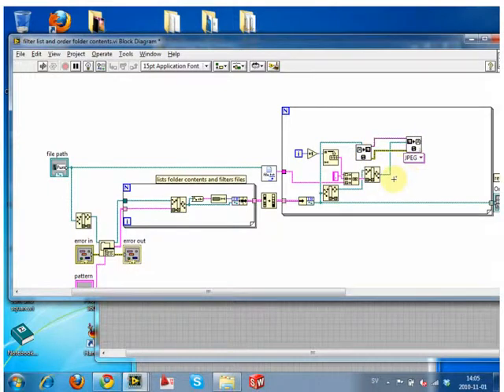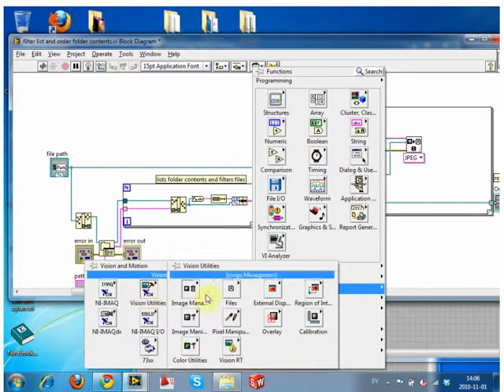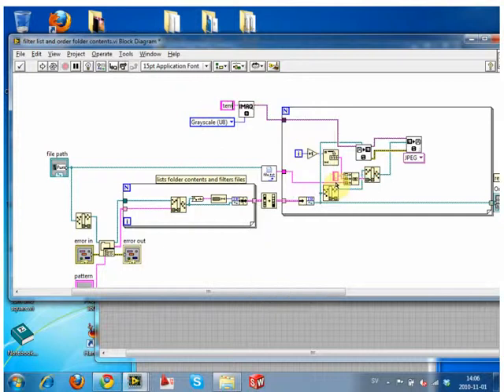The only thing that we need to add right now is there's no buffer in the memory for this. So we have to make a little buffer memory because we have to open the file if we want to resave it as something else. So we just push that guy in there. You can give this any name, it doesn't matter because it's just a temporary buffer. It just needs to be somewhere when it opens it. This then rewrites all the files. So you could run this, and if you had an arbitrary file of JPEGs, running this program now would filter them for that particular value and then rename them based on what number in the list they are.